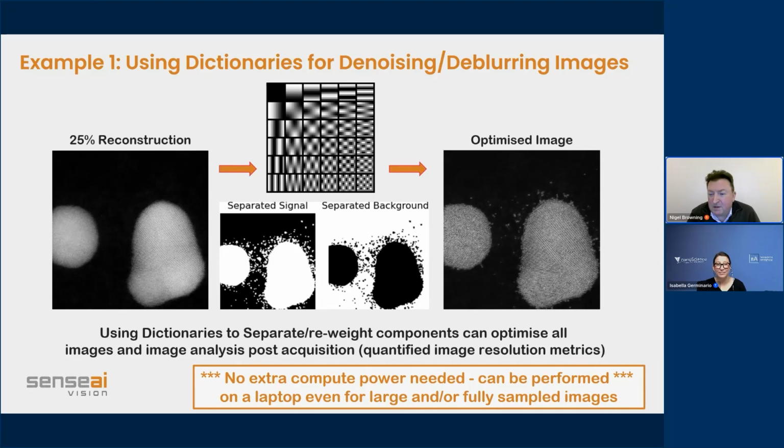But in terms of the installation, as I was trying to say, with 2025 being the year of hardware development, essentially we can install the software on any microscope into that system, whether it plugs in through an external scan generator or just plugs into the external port that is used by EDS manufacturers and to take over the scan.